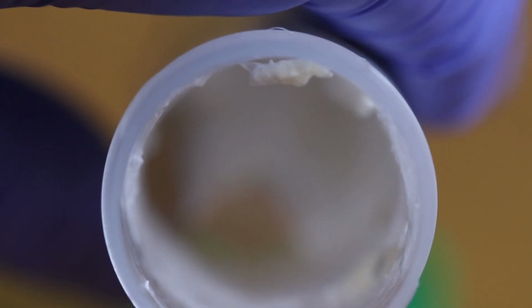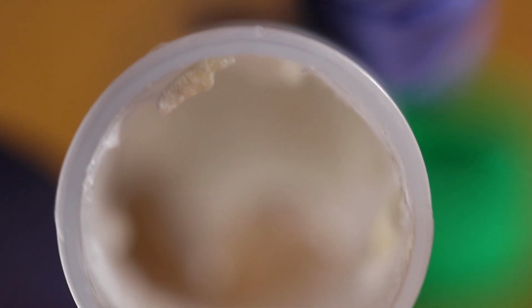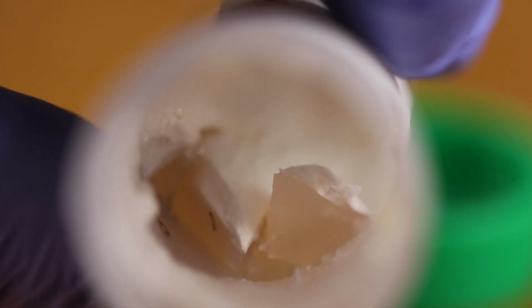Here's a good look on the inside of an agar slant. You can see that you can make tons of these needle biopsies from how much agar is in there. I mean, you can make hundreds from a slant. You can make more slants from a slant. You can make dishes. That's basically, you know, buying from a slant gets you the closest possible strain to the original and just allows you to make a ton.